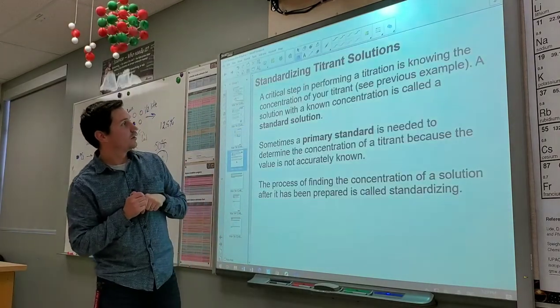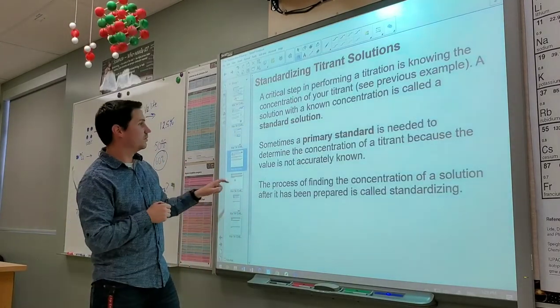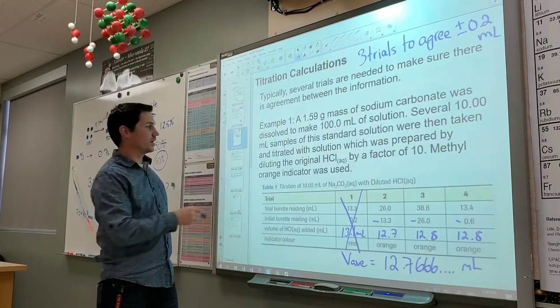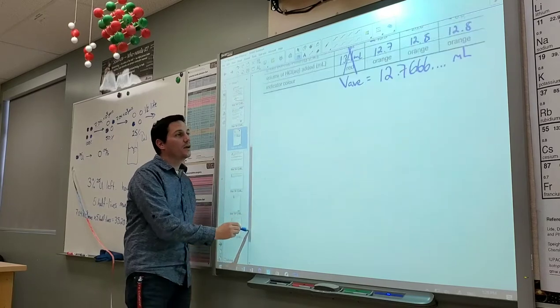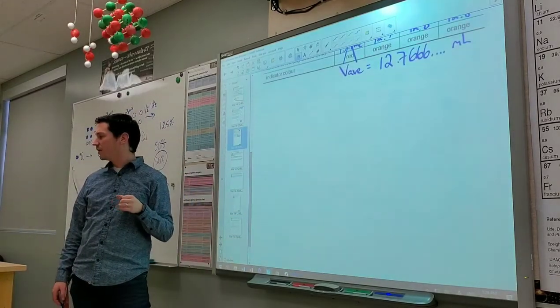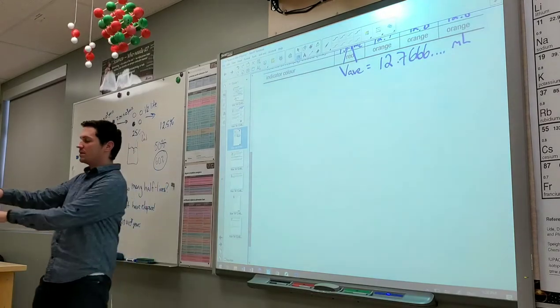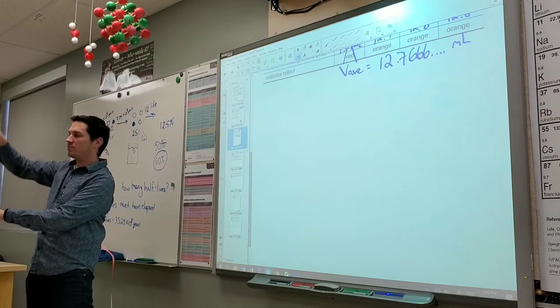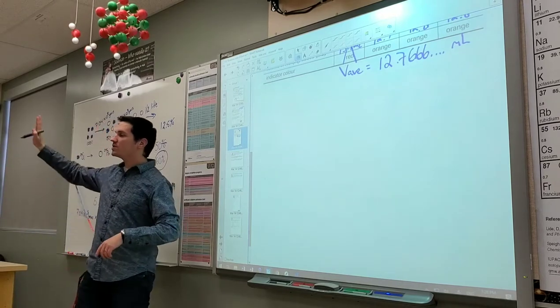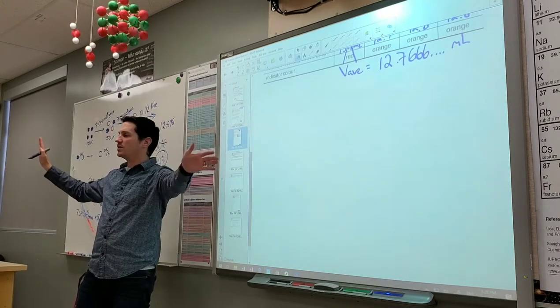Let me just see. I just want to make sure that we're on the right track. Good. Okay, so what's this reaction? What is the reaction that we have going on? Do you know what's in my titrant? Do you know what's in my burette? Read the question. One of them is always a titrant, and one of them is always a sample.